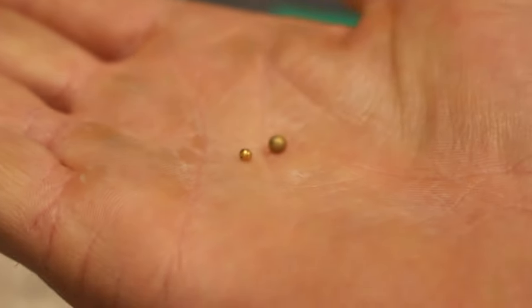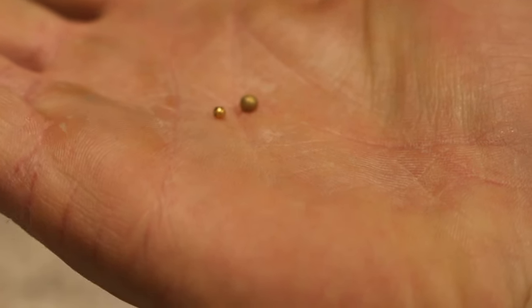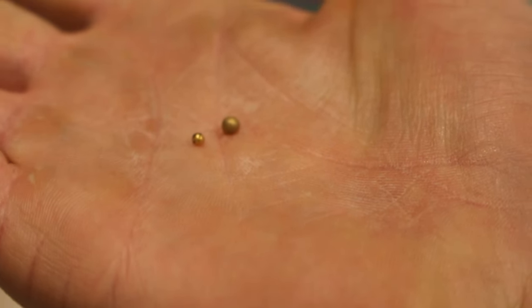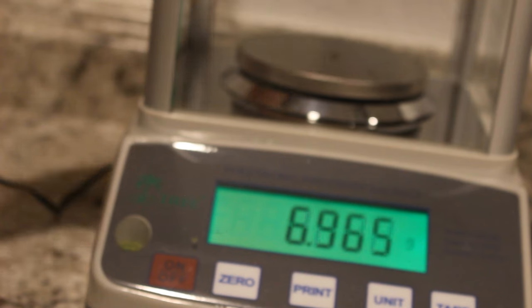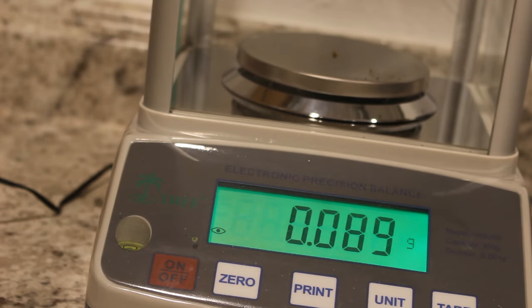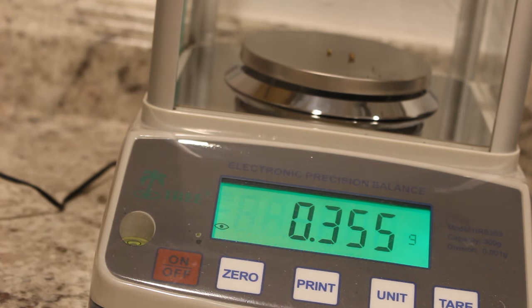You'll notice the cyanide process produced a much purer product by the looks of it. Let's see how much this little guy weighs. Fortunately I have a scale that can actually do it. Not quite a tenth of a gram. Both of them together — let's see what that weighs. Now we've got about a third of a gram. So two days worth of work and I managed to get a third of a gram of gold. How about that?